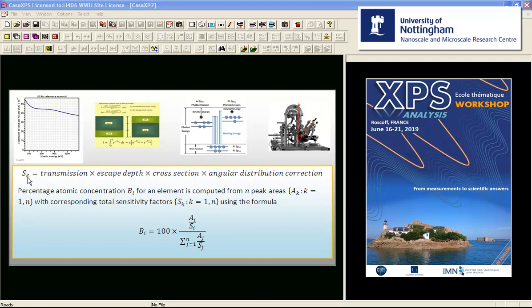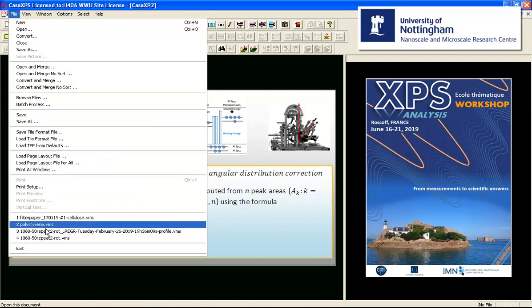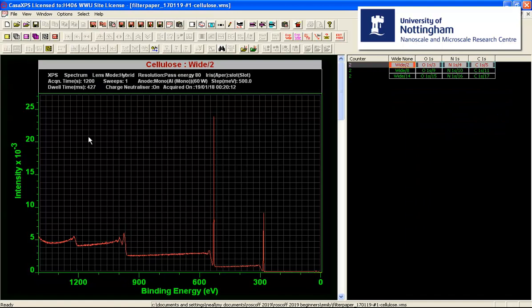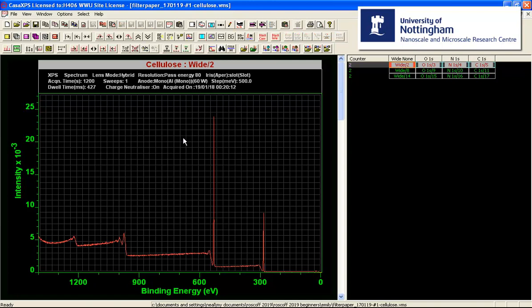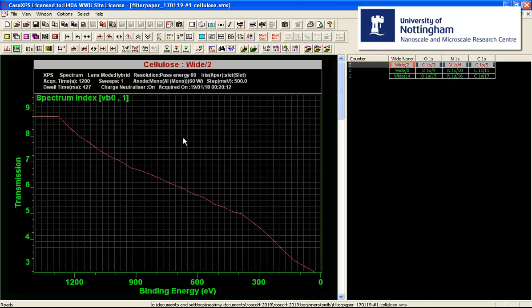This means that the standard Kratos library, which contains a set of sensitivity factors, can be applied to any new instrument provided the transmission is characterized in terms of a response relative to the standard instrument. We will now look at an example of cellulose measured using a Kratos Axis Ultra in hybrid lens mode with pass energy 80. These data also include the relative transmission function that allows quantification with the Kratos relative sensitivity factor element library.